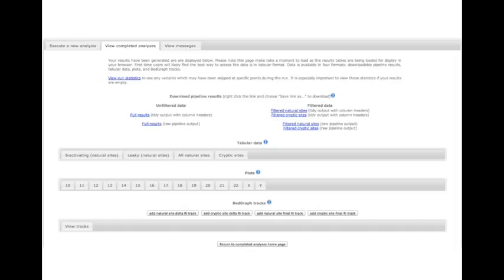Finally, let's upload some bed graph tracks and examine them in the UCSC genome browser. If we click on the View Tracks tab before clicking any of the buttons above it, we'll see that a message is displayed indicating that no tracks have been uploaded. If you've already uploaded tracks from the Shannon pipeline since the last time you closed your browser, you may notice that the tracks are already present. In that case, we should remove those tracks before uploading the new tracks.